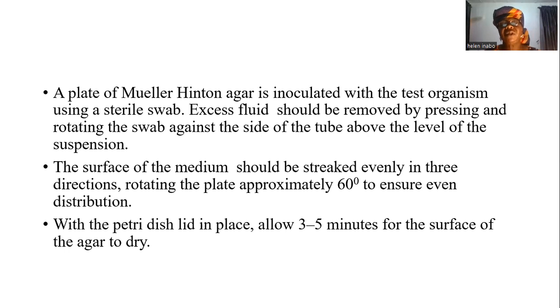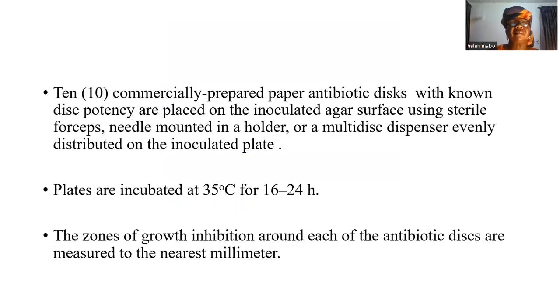The surface of the medium should be streaked evenly in 3 directions to ensure confluent growth, rotating the plate approximately 60 degrees to ensure even distribution. With the Petri dish lid in place, 3 to 5 minutes are usually allowed for the surface of the agar to dry.